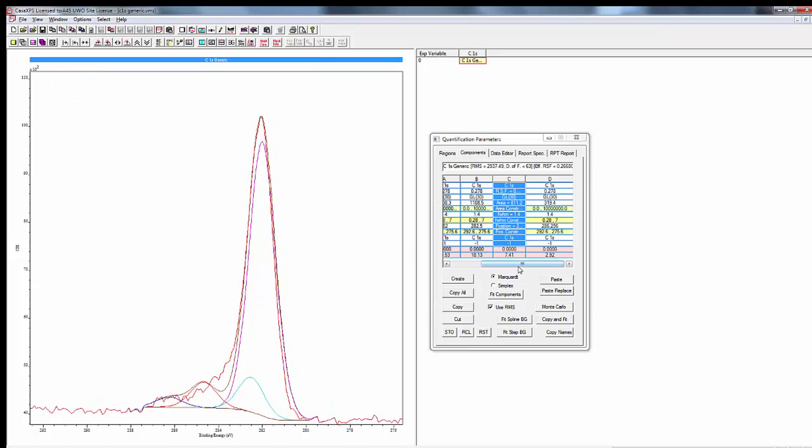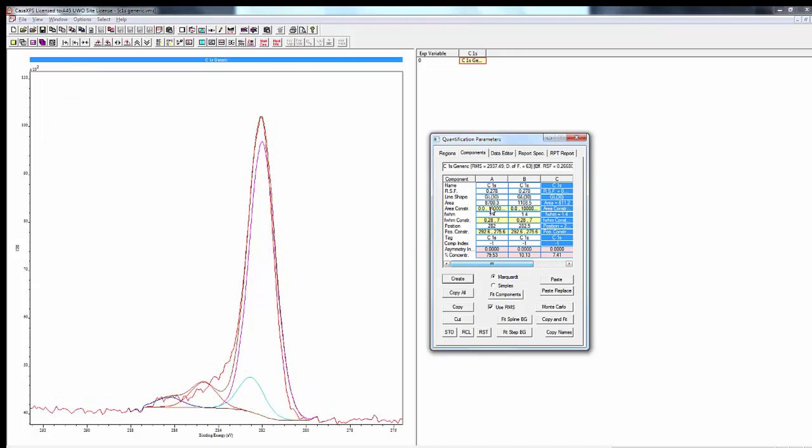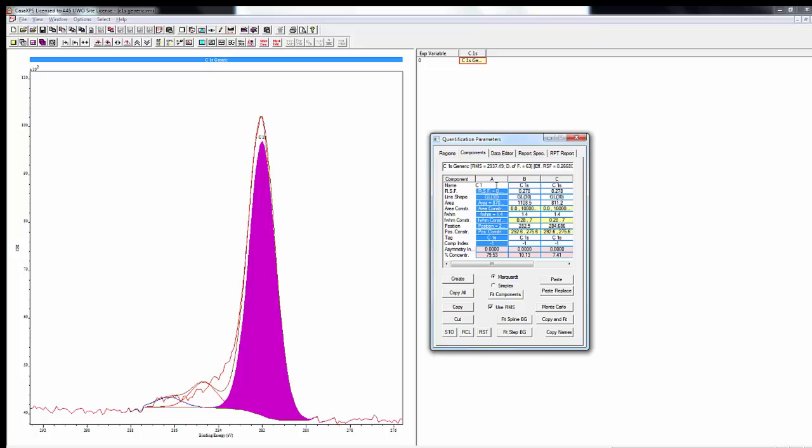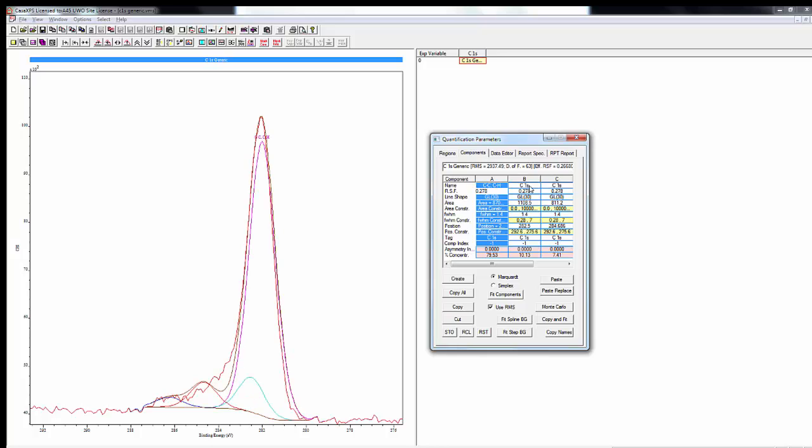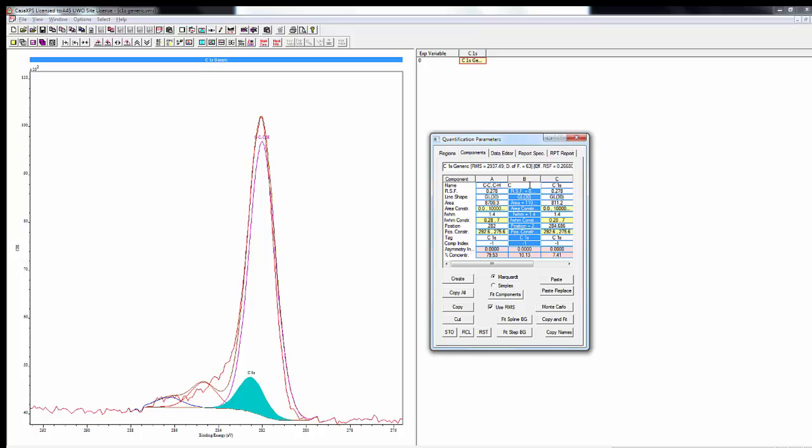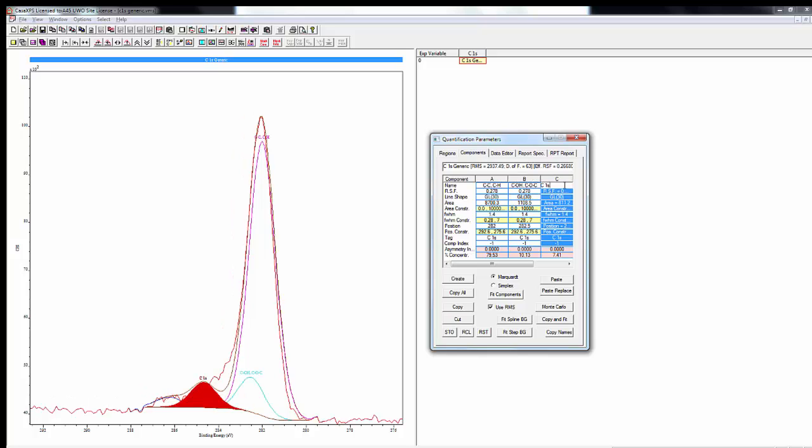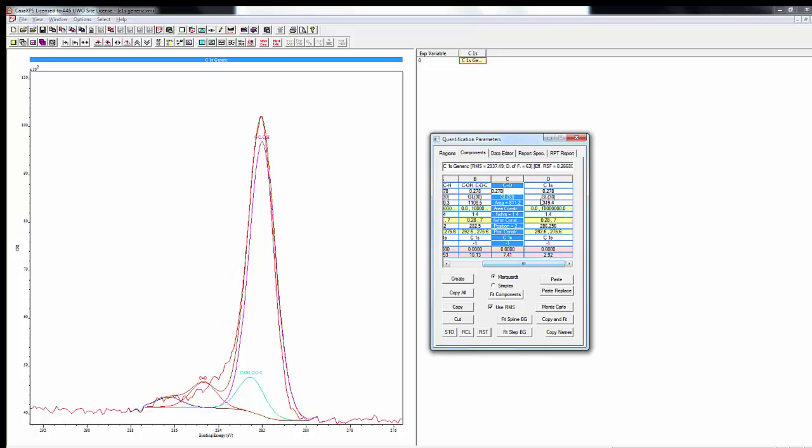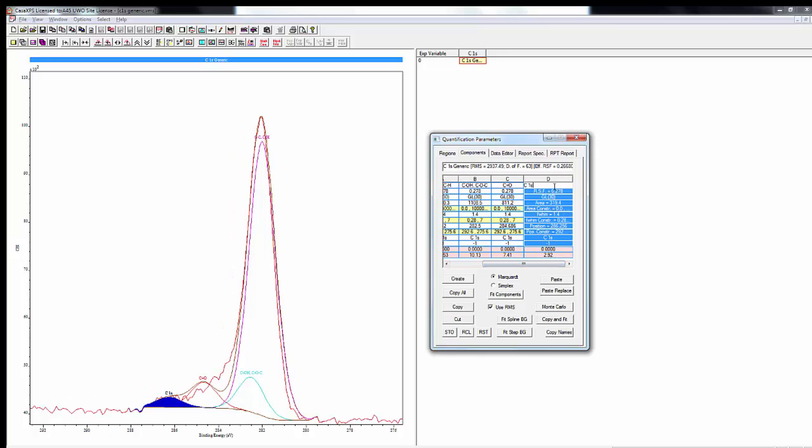The first peak will be our aliphatic component, so that's carbon bound to carbon and carbon bound to hydrogen. The second peak will be our alcohol and ether component, so carbon singly bound to oxygen. The third component will be ketones and the fourth will be esters and acid functionality.